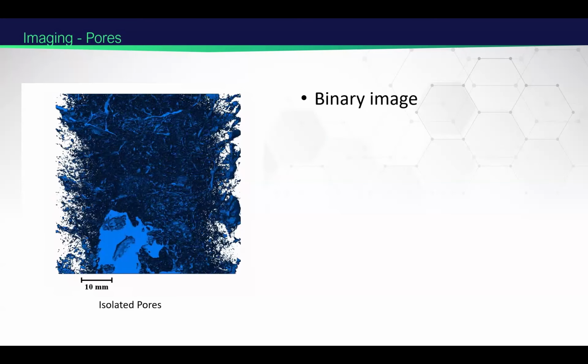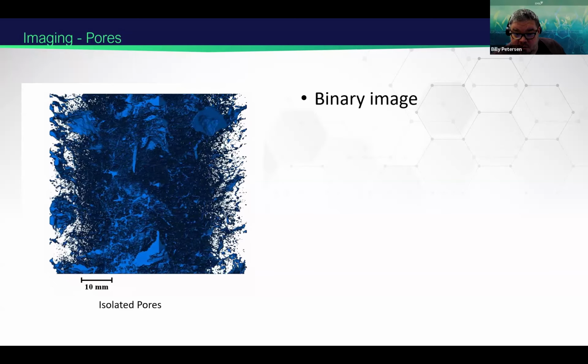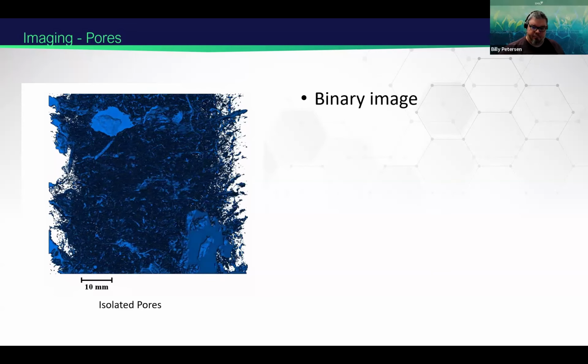So, Billy, Mr. Fleury, that was great. Yes. Billy, this is Sharon. I have a question. Is it 1% of pore volume or 1% of the number of pores? 1% of the number of pores. Okay, thank you. No problem.